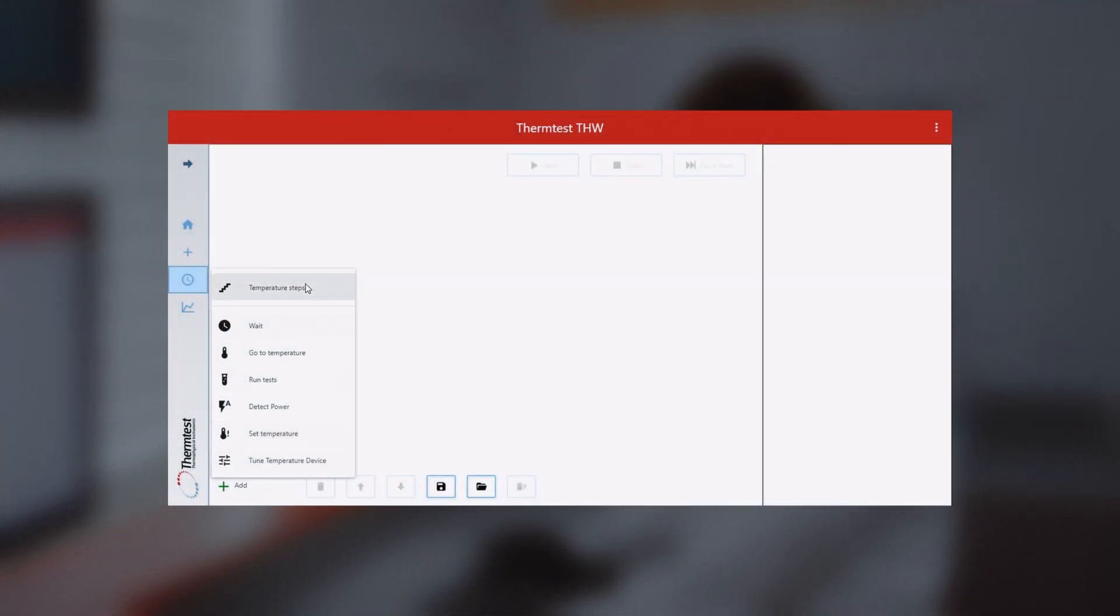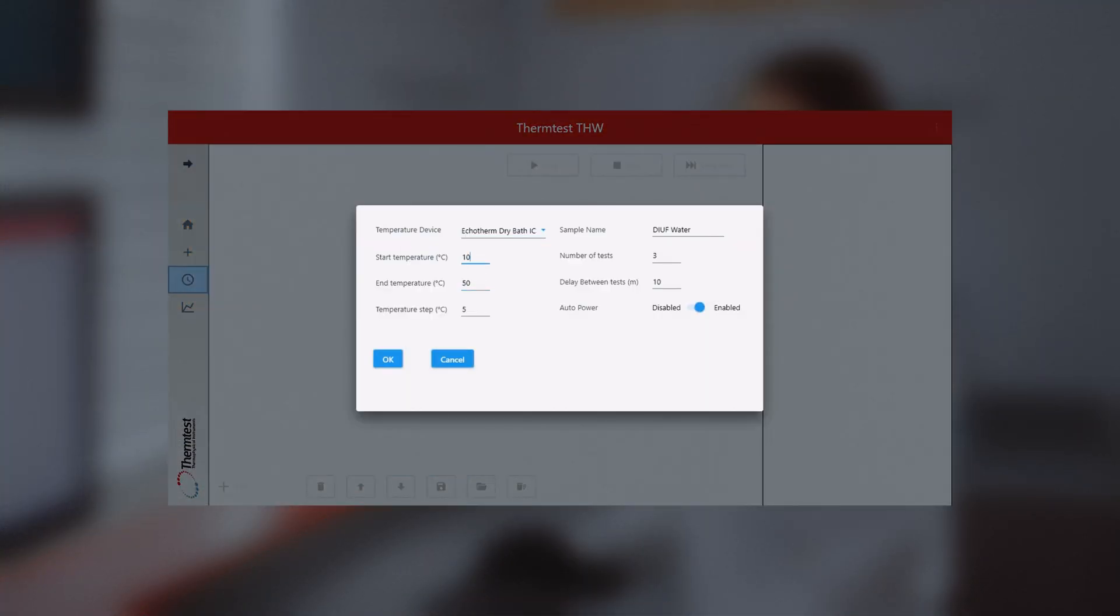The THW L2 can be controlled through the front panel with the push of a button or through a Windows-based computer software.